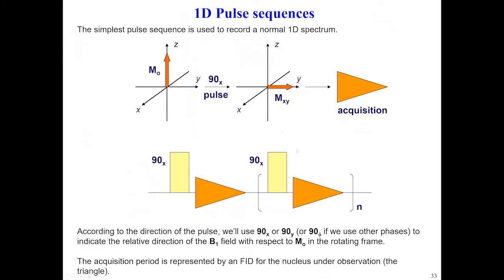The way we typically present an NMR experiment is, as we said, to go through it step by step. We had M0, we do a pulse, we incline it to XY, and then we acquire the signal. This is good for teaching, but very impractical when we discuss which experiment to use. So these are typically labeled like this. You wait, you excite, and then you detect. There's a little time, but this is not to ratio.